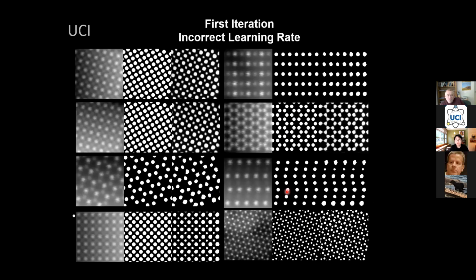And this is our first iteration of training, and we found that on the left are the images, the middle column here is the ground truths, and the third column is the results that's spit out from the neural network.